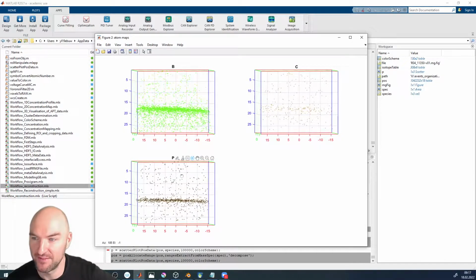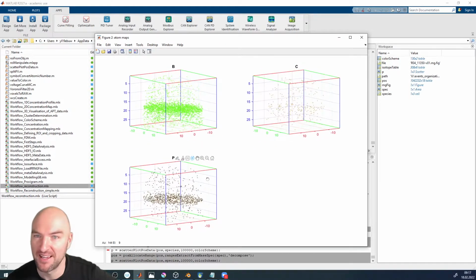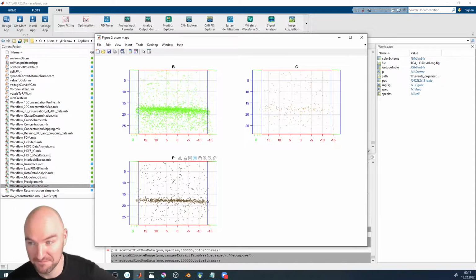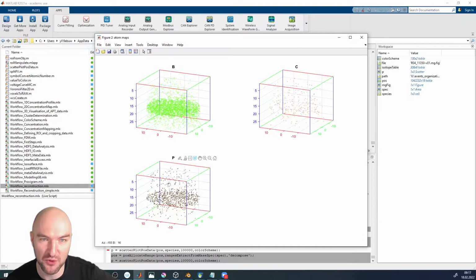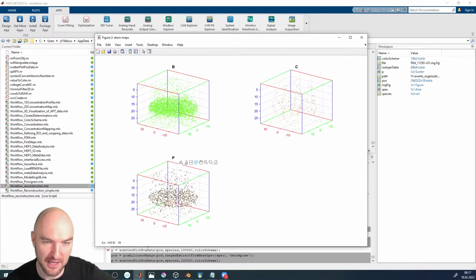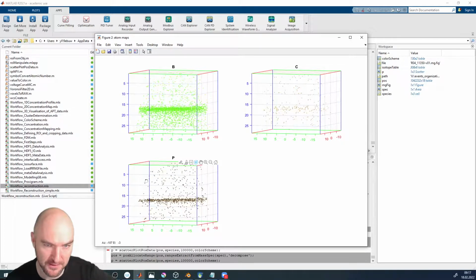This is a very valid question, because obviously Blender doesn't read POS files anymore. Unfortunately, it used to. As a hint, and this is already a preview of what's going to happen, with the Blender 2.8 version, we used to have a plugin for Blender called Atom Blend.